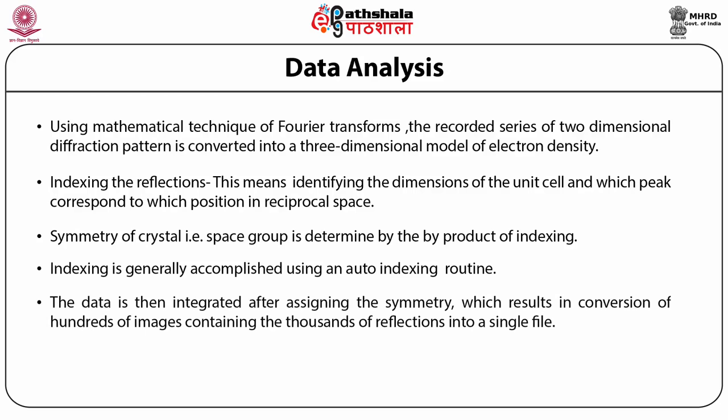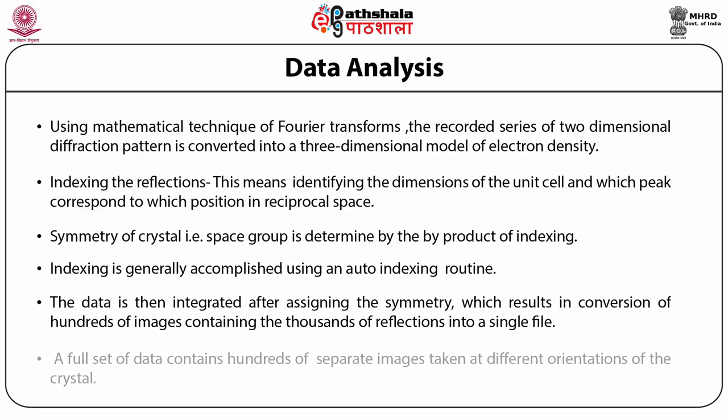The data is then integrated after assigning the symmetry, which results in conversion of hundreds of images containing thousands of reflections into a single file. A full set of data contains hundreds of separate images taken at different orientations of the crystal.